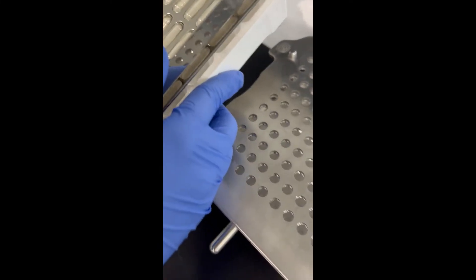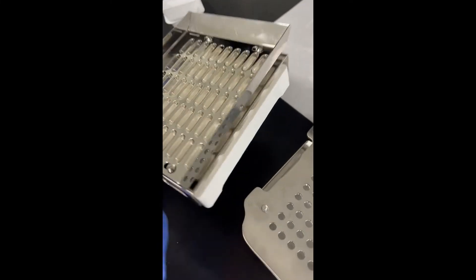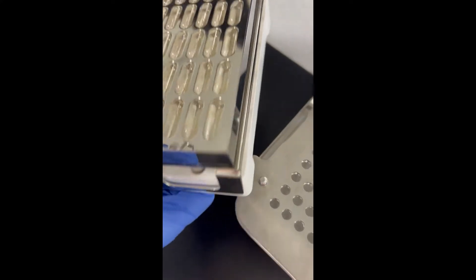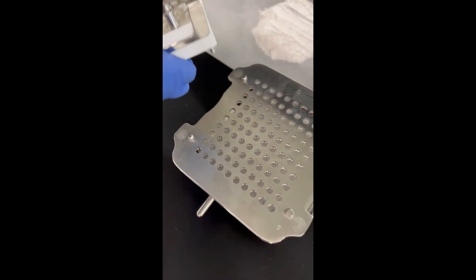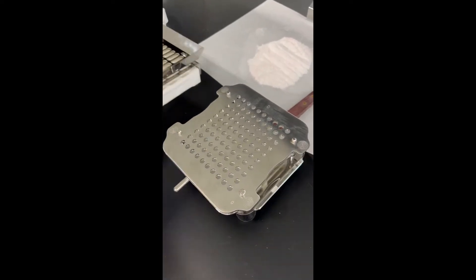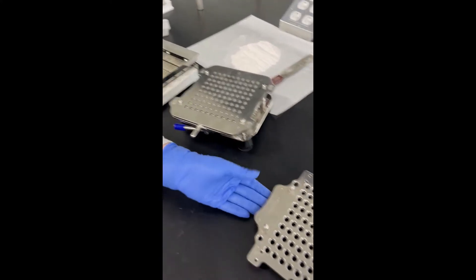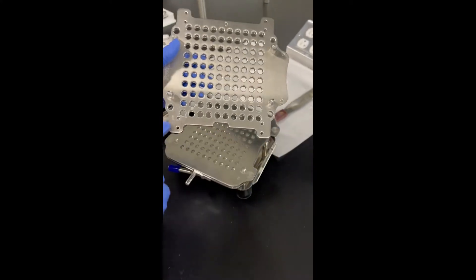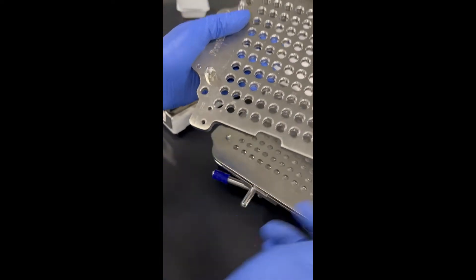If for some reason you end up having an extra capsule, you can just pour it back into the bottle. So once your capsules are in, this larger piece is actually going to go on top, and the little numbers in the left-hand corner are going to be pointed at the bottom.